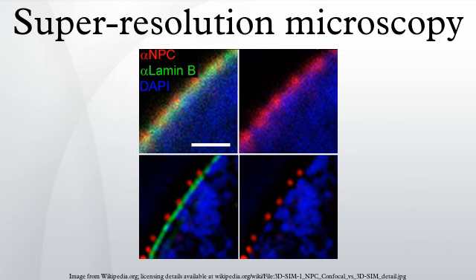Examples for this microscopy are shown under Section 2.4, Structured Illumination Microscopy, images of cell nuclei and mitotic stages recorded with 3D SIM microscopy. Stochastic functional techniques.